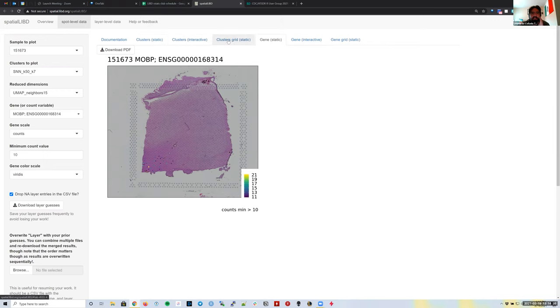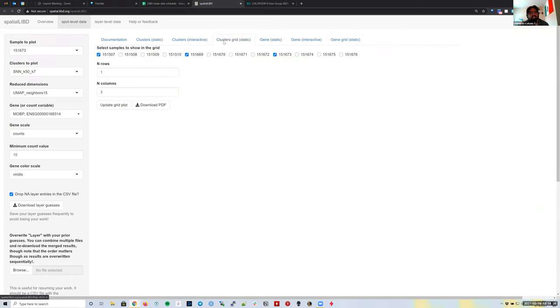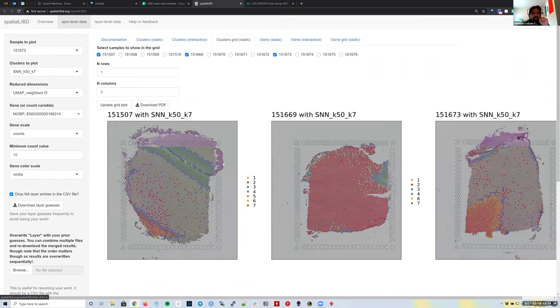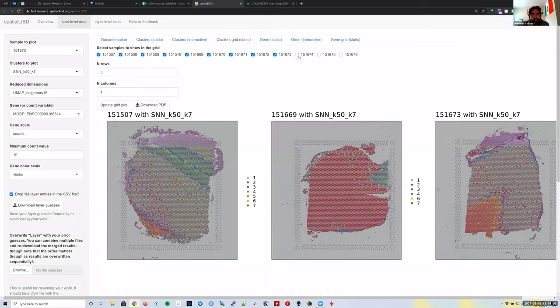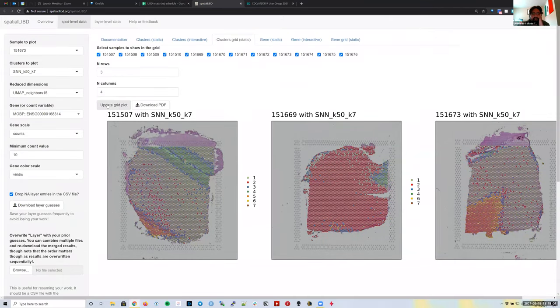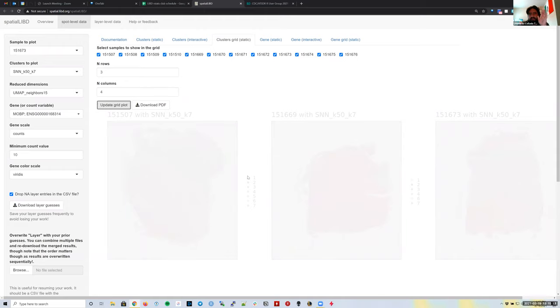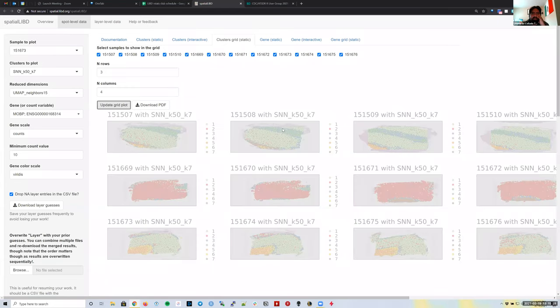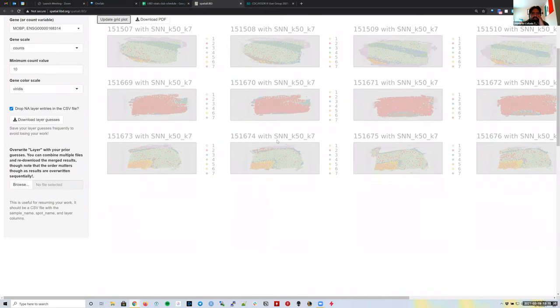There are also Cluster Grid Static and Gene Grid Static tabs. The Cluster Grid Static makes the same plots but in a grid layout. By default the grid has one row and three columns, but you can set it to, say, three rows and four columns and select all 12 samples. Because this takes time to render, there's an 'Update Grid Plot' button you need to manually click before the image is displayed.